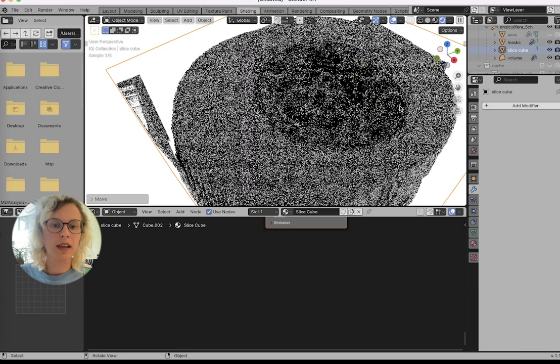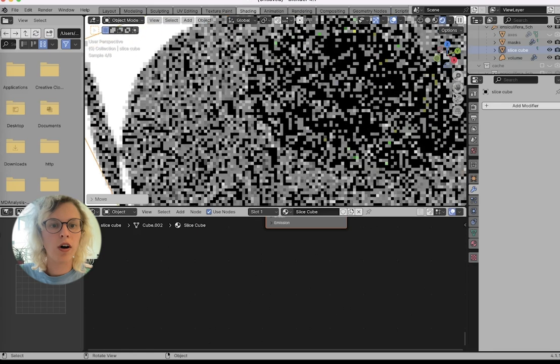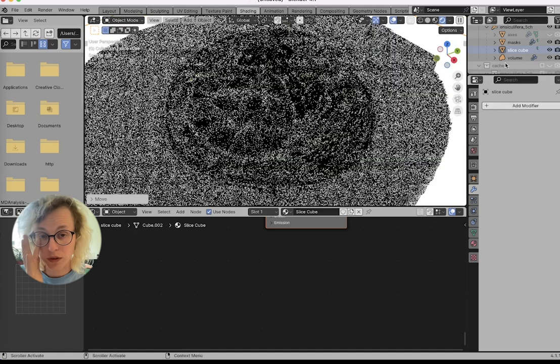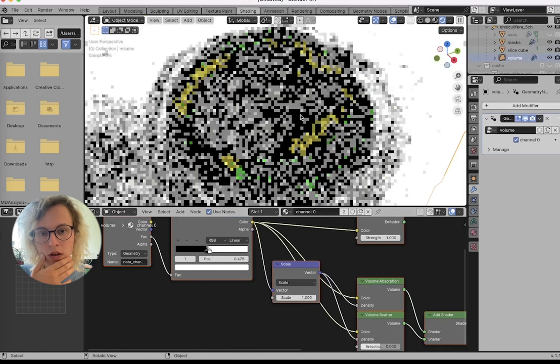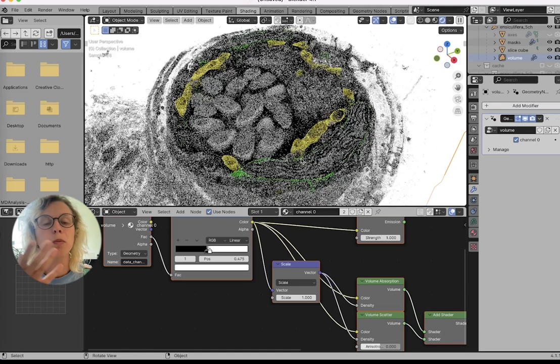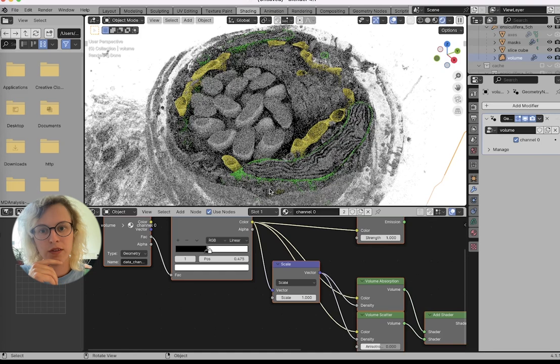So you can see that if we have a sliced object, it does kind of hide a lot of our segmentations because these are in these dense regions that we're filtering. This could be alleviated a little bit if we do not invert it, because then there is more electron sparse matter and we can see through more of the volume. So we can see here that the green is indeed the chloroplast because we have this beautiful ringing of our thylakoids.